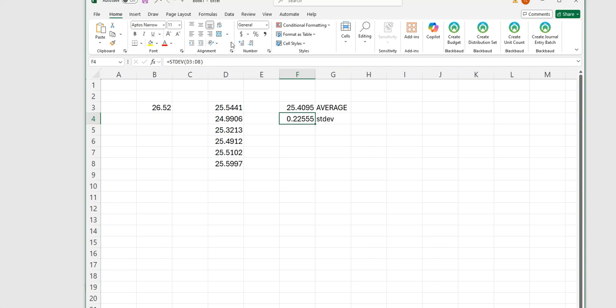What I'm after is right there beside it. It's an arrow that points left and an arrow that points right, and there are numbers assigned with it. So I need the number to go shorter, and I'm going to hit the arrow that points to my right, and that will shave off that last digit, and it will round that number the proper way. So that is matching now the number of digits after the decimal point, and it looks a little bit cleaner on the spreadsheet because of that.